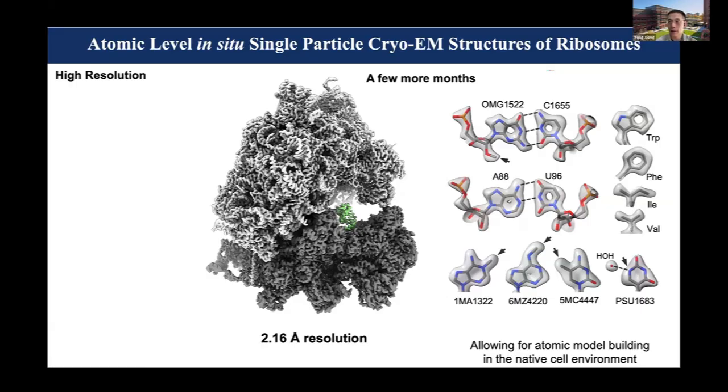And we see a lot of post-transcriptional RNA modifications, like this methyl group on the sugar and the methyl modification on the bases. And we can also tell this is a pseudouridine. It's not a cytosine because the water is here, hydrogen bonding to this position, so it cannot be a carbon, it has to be a nitrogen. So we know it's pseudouridine. Really very high quality. We can do a lot of analysis on this.